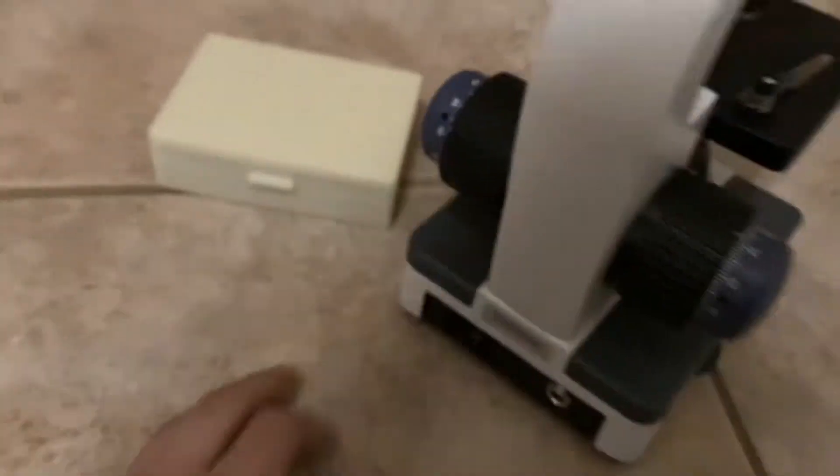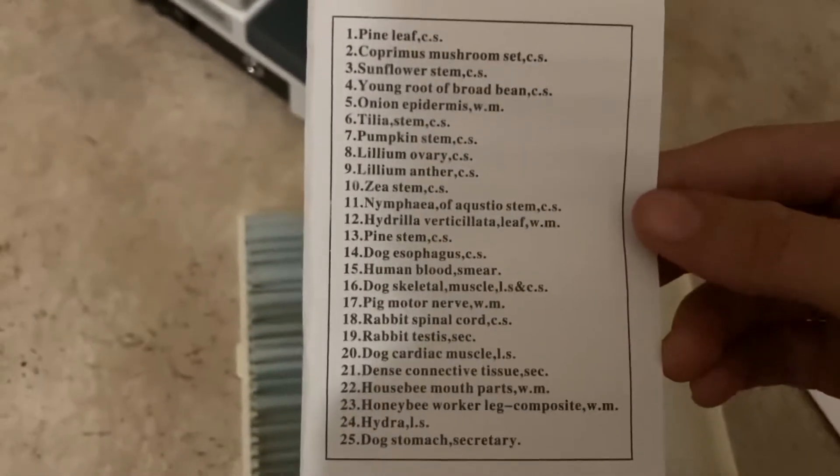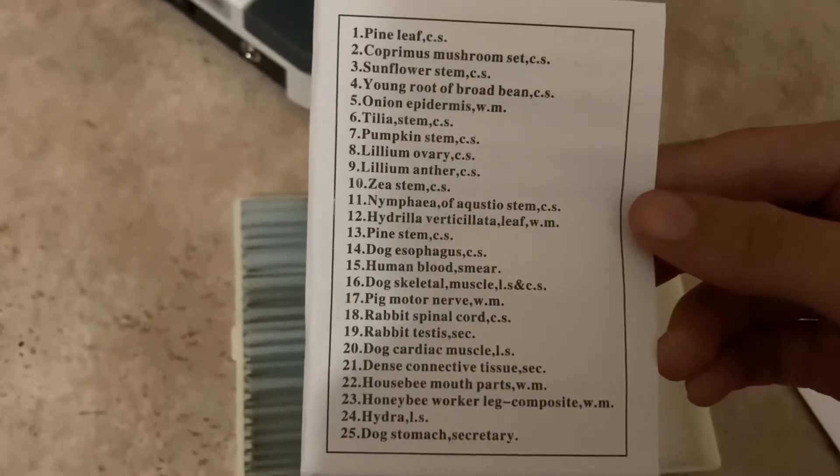For now I'll just turn it off. It comes with this box — it's kind of hard to open. So this is what it comes with, and there's a paper showing what these slides display.